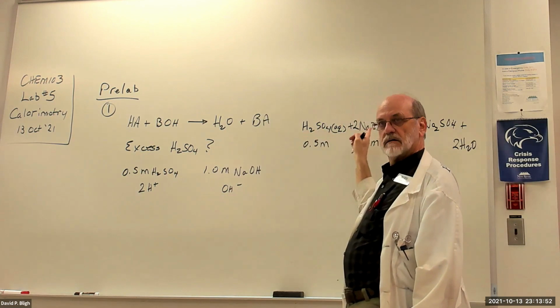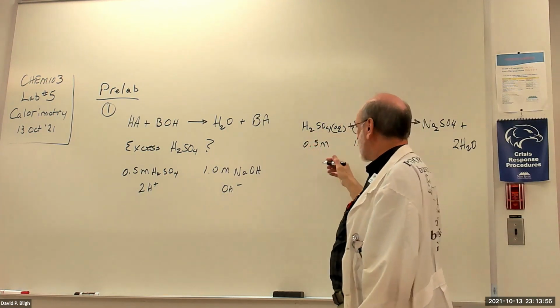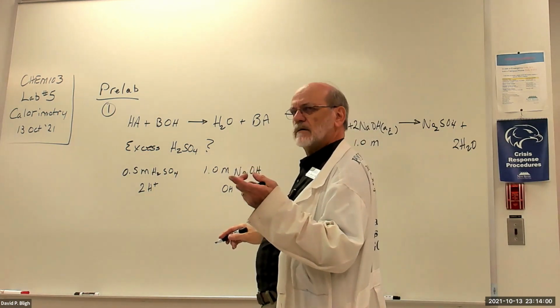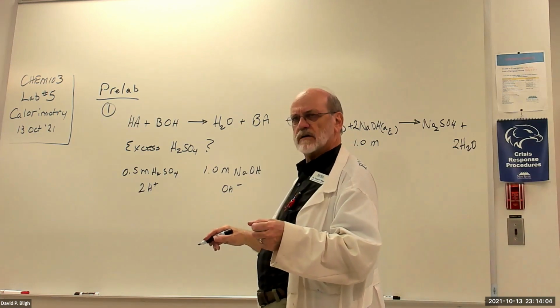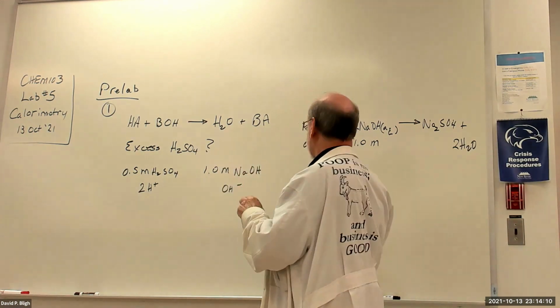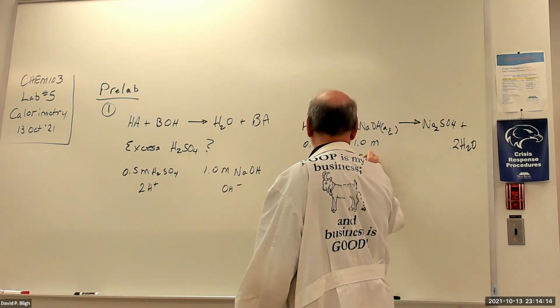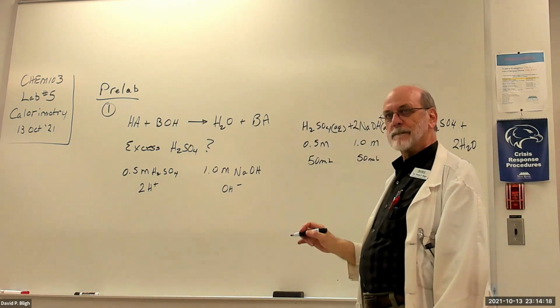in this stoichiometry. So if we use equal volumes, what was it, 25 mL each? Or is it 75 each? No, it's 50 and 60, right? Okay, if we were to use 50 each, that would be a stoichiometric mixture.